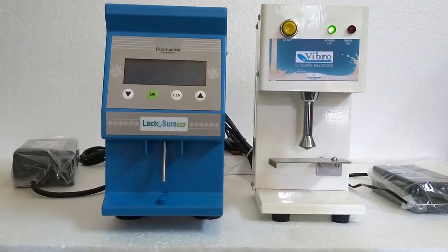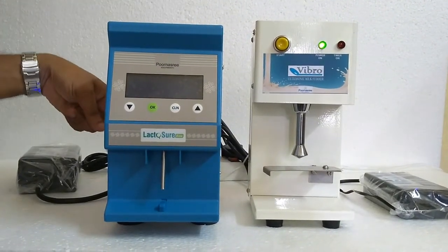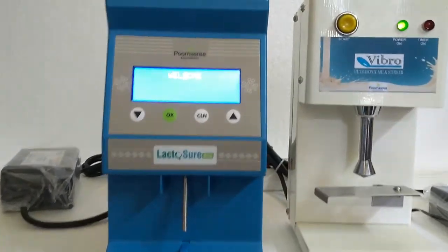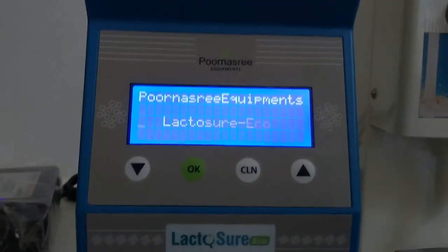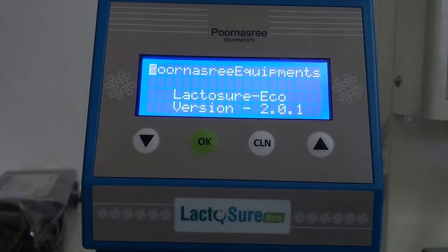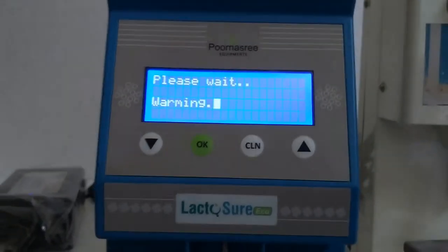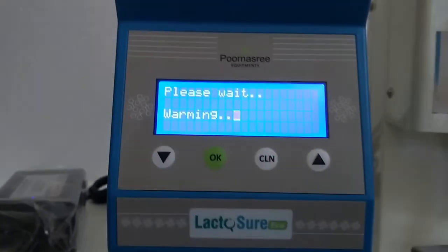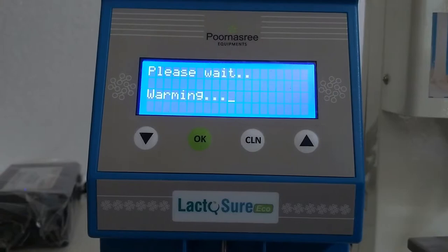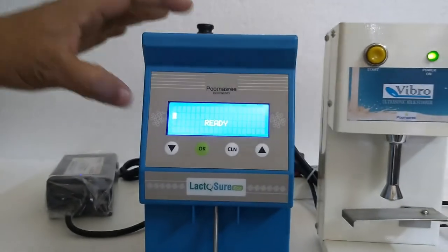Let us see the working of Lactosure Eco. We have connected the adapter to the analyzer. Just put on the back side switch. It is now showing a welcome screen, then the details like manufacturer name, version, dealer name, and serial number. The device is now warming up — wait for some time. Now it shows 'Ready', which means the machine is ready for testing.